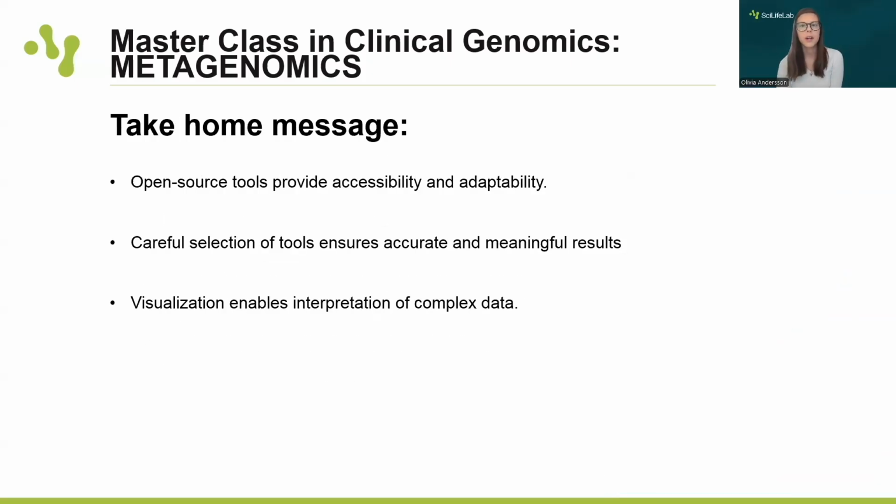And just to quickly summarize, these bioinformatics workflows are rather complex and multifaceted and involve multiple stages that collectively enable the analysis of microbial communities. However, it's not just the individual steps that matter, but how they are integrated and how the right tools are selected to address the specific research or clinical question. Numerous tools as well as complete pipelines are available for this, and given the varying differences of these tools, selecting the most appropriate one is an important factor.